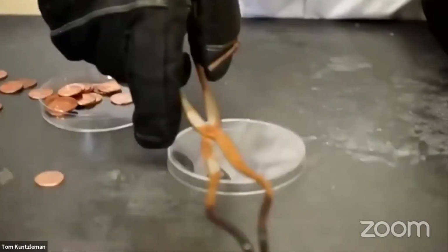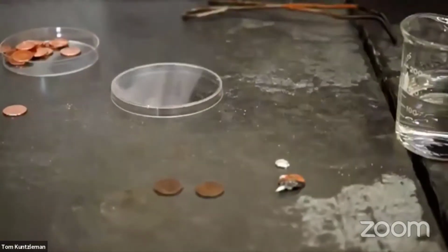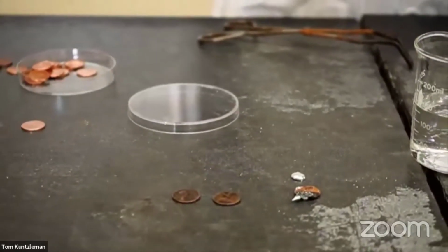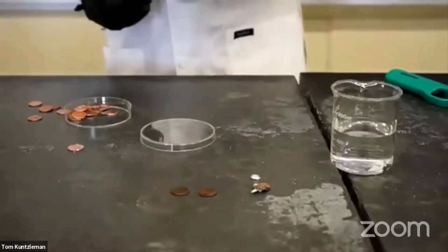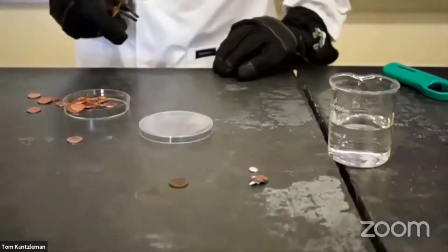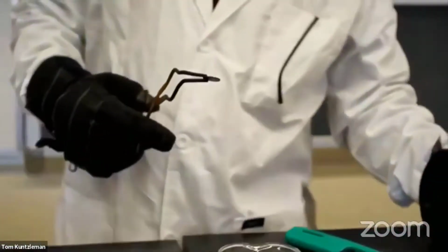Let's try the same experiment with one of these old pennies, shall we? Let's see what happens. All right, get the blowtorch going again. Check out our old penny. Old pennies made before 1982. Here we go.